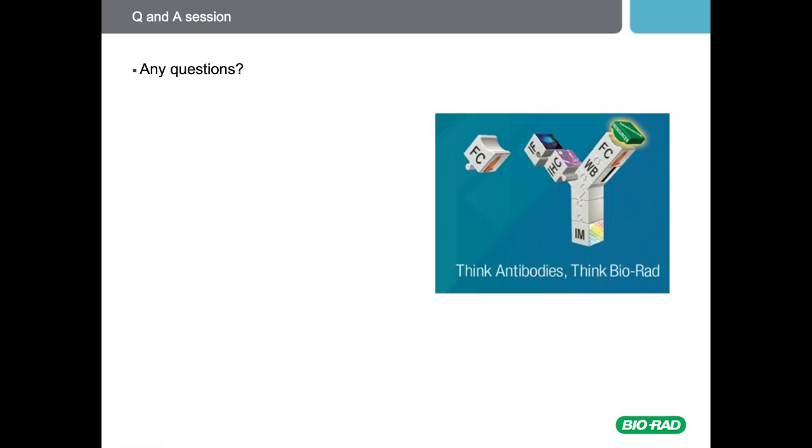Okay, the next question. What is the best way to prepare platelets for staining? Again, the best first thing to do is collect the blood in the right anticoagulant. This will often vary depending on what experiments you're performing. But I would recommend you using acid citrate dextrose. And platelets are very easily activated, so you need to mix the blood and the anticoagulant very gently. If you shake or pipette too much, you will activate your platelets and they can clump.